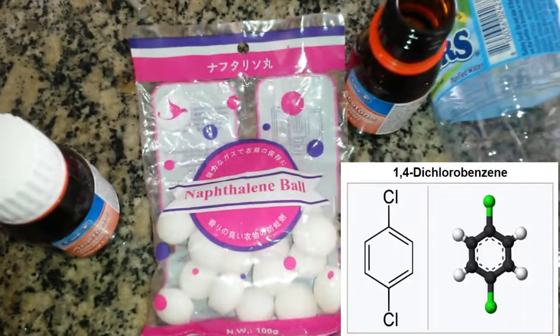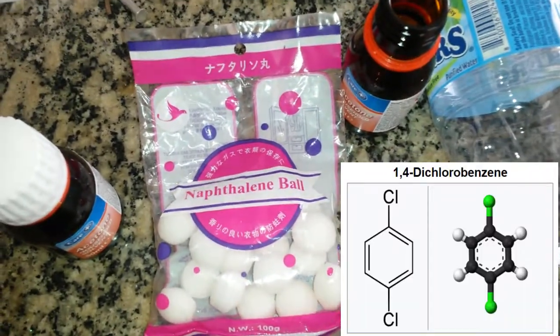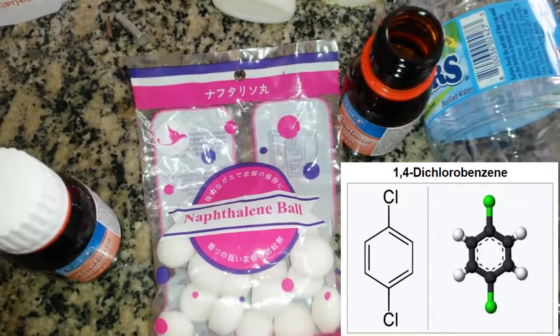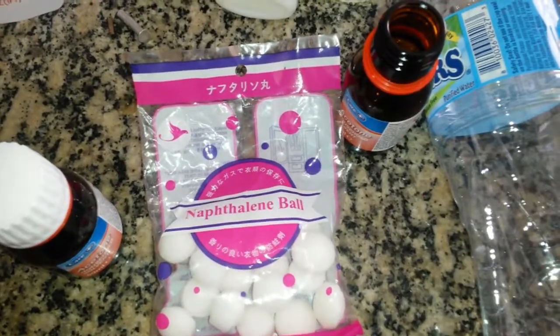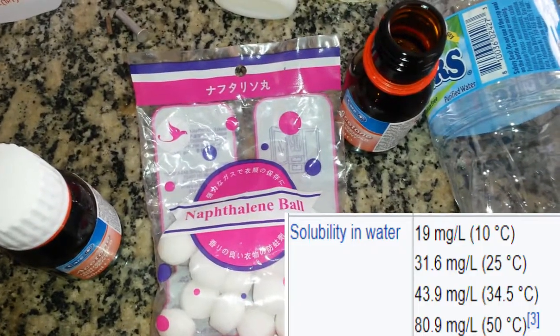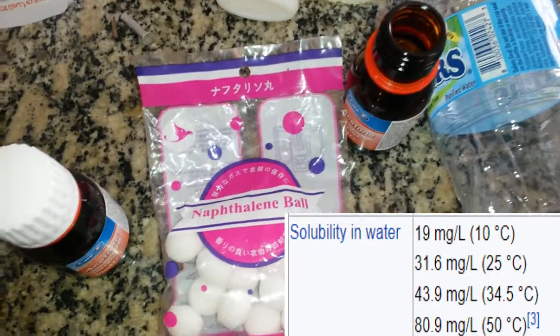These balls are actually for dichlorobenzene — I'll put a picture of what it is — but it's a benzene ring with two chlorines directly opposite each other. Interestingly, it's noted as not soluble in water.